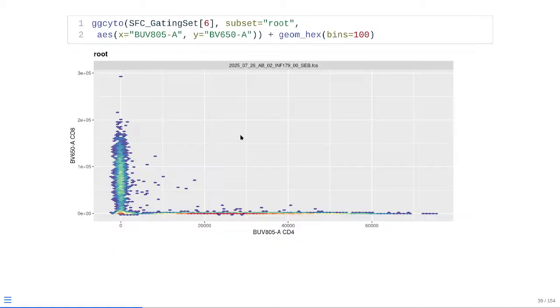There will always be multiple logs of events that really expand out this x-axis. So part of the reason we transform is that we're compressing this more logarithmic space of the scale down to something that's manageable, either using the bi-exponential or a logicle transformation, while still keeping the region of the scale that behaves linearly in a linear fashion.